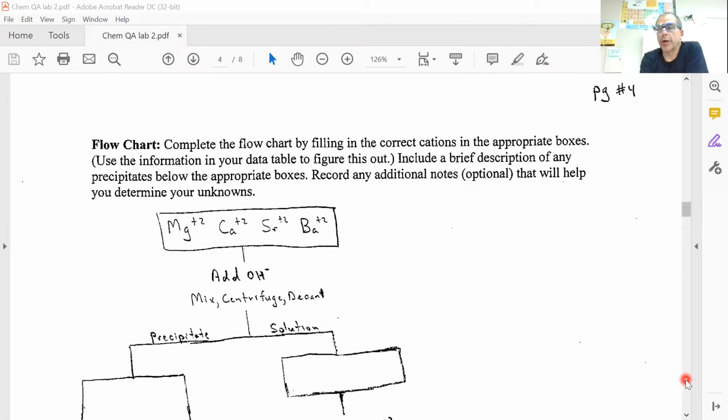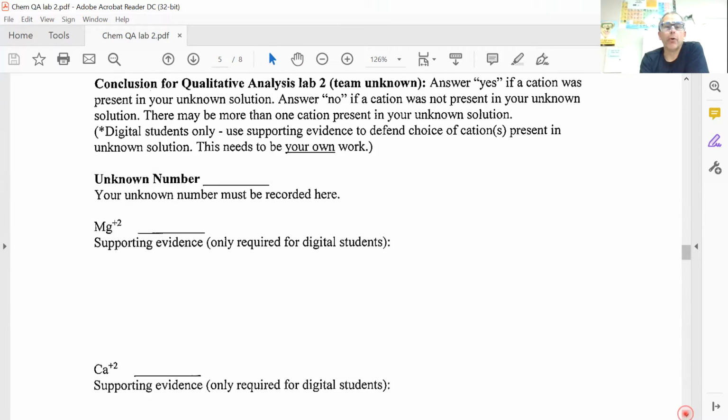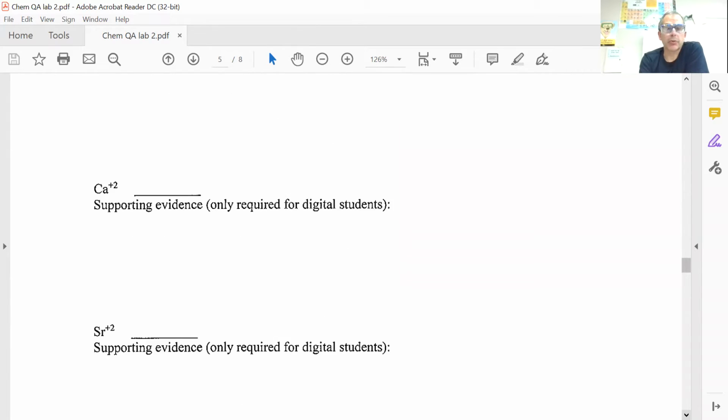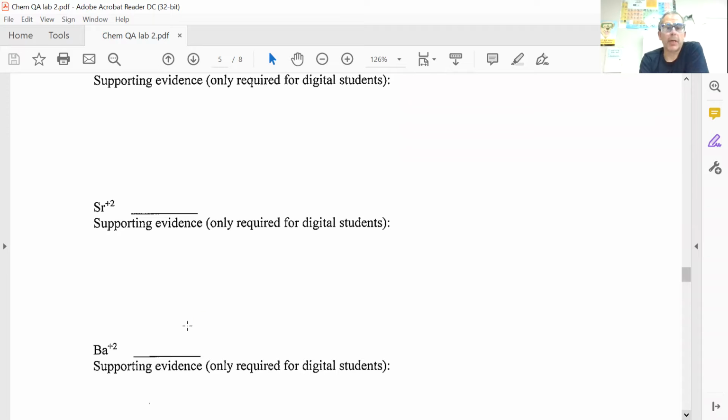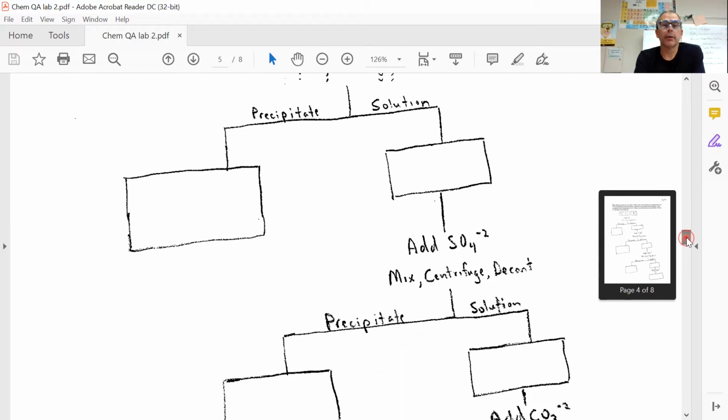Just about what you're going to be answering for this is yes or no. You'll put Unknown B and then magnesium, yes or no. Calcium, yes or no. Strontium, yes or no. And barium, yes or no. The other piece that you will have is supporting evidence for each yes or no choice, and watch the general information video for details on that.